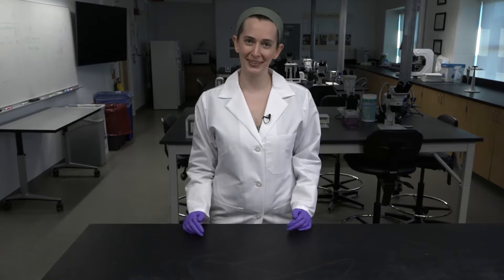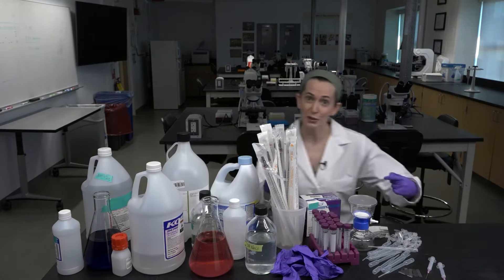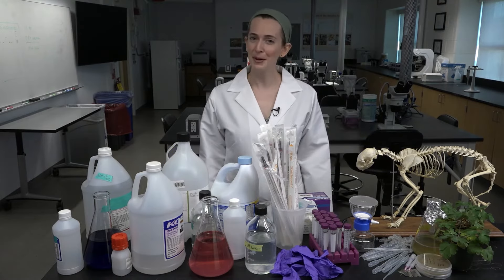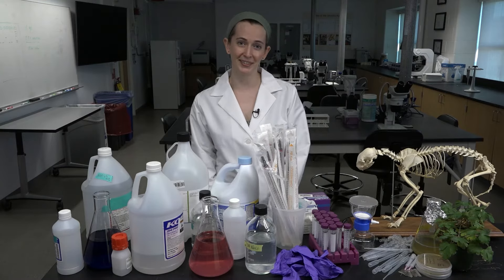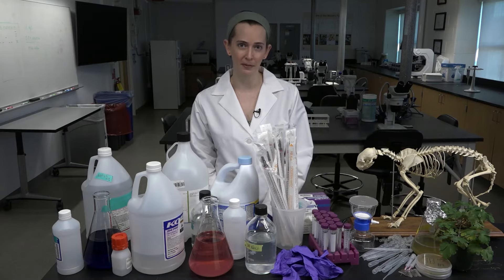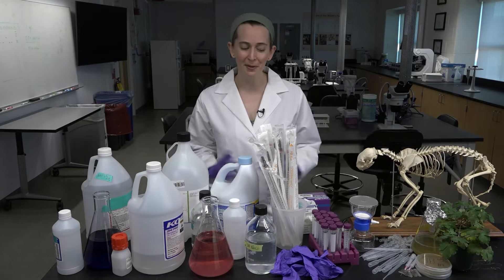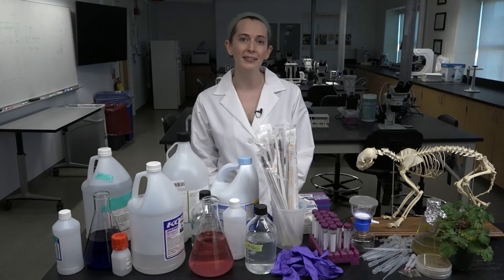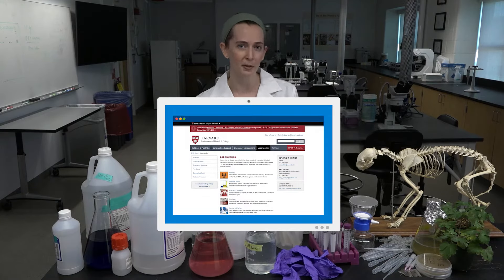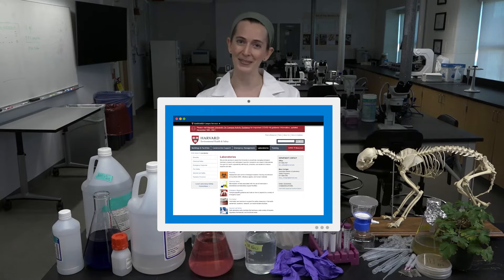One thing you'll notice super fast when you start working in a lab is that you generate a ton of garbage doing science — chemicals, tubes, organisms. But what do you do with all that waste? We can work with some pretty dangerous materials in the lab, so there are important rules and regulations for how to dispose of it all properly. In this video, we'll go over some common waste disposal techniques, but your Environmental Health and Safety Office and your lab will have more detailed instructions for your particular workspace, so be sure to follow their guidelines and training requirements.